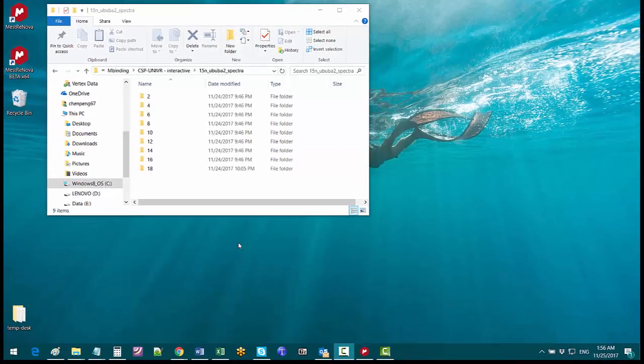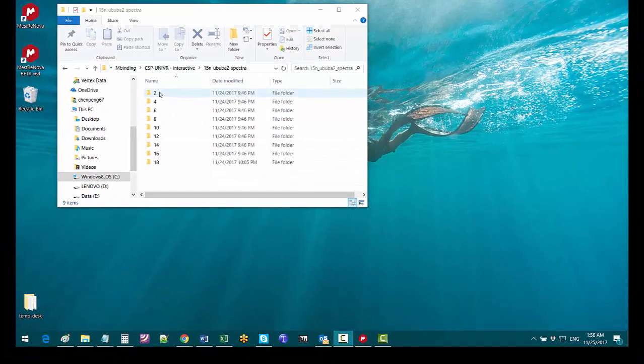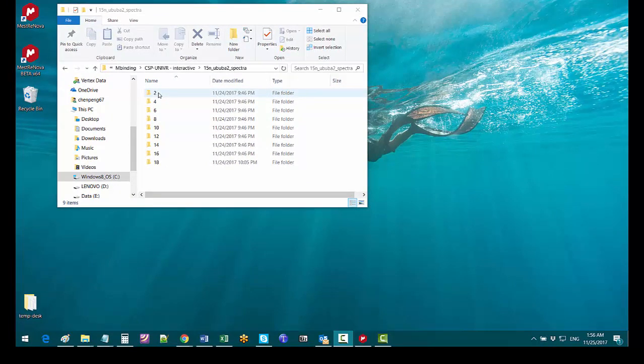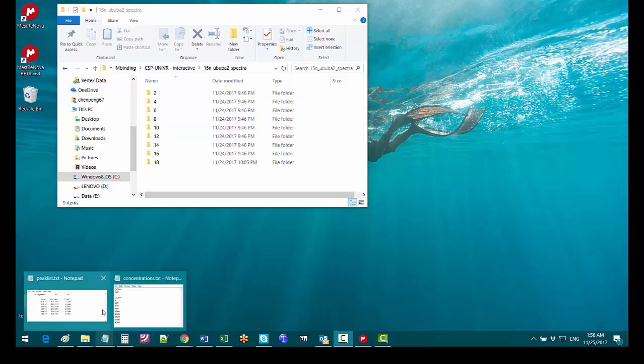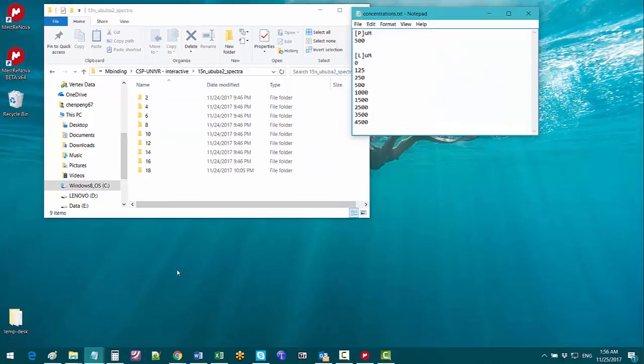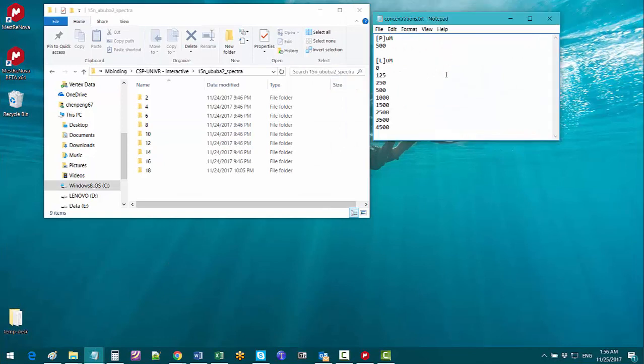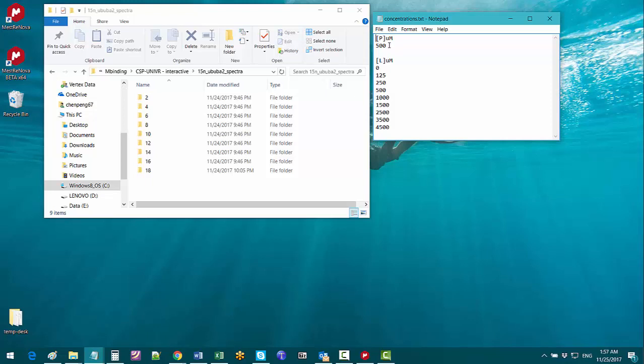Here in folder number two is the NH-HSQC spectrum of protein only. The rest of the folders contain HSQC spectra with ligand gradually added to the protein. In this text file we have the protein concentration at each point and the concentration of the ligand in micromolar corresponding to each of these spectra.